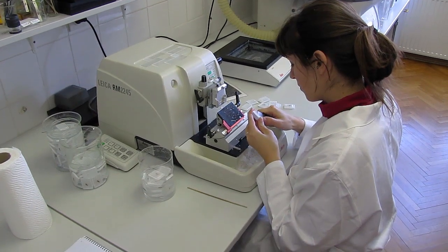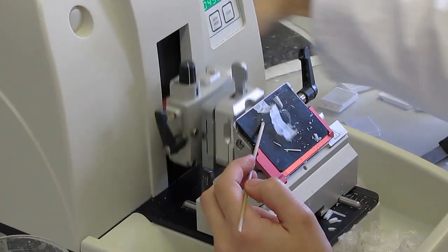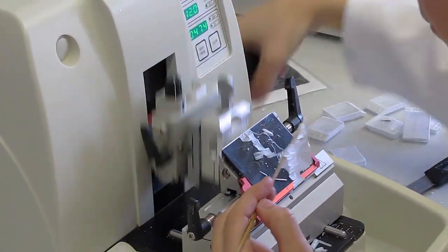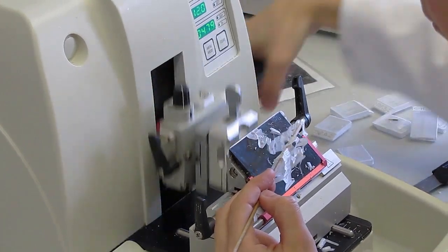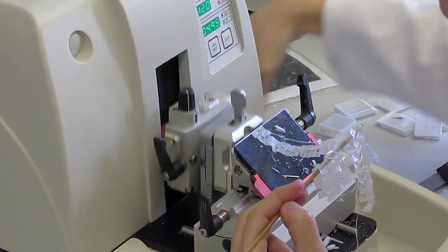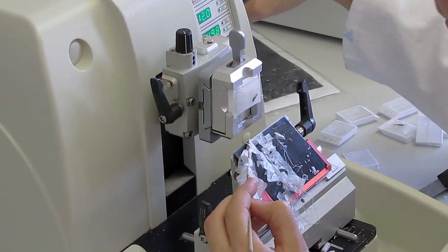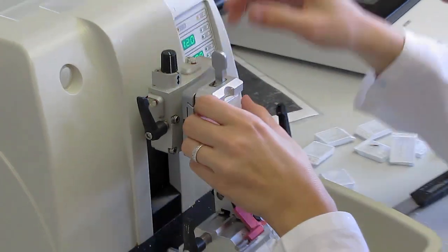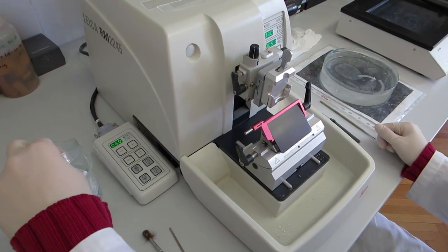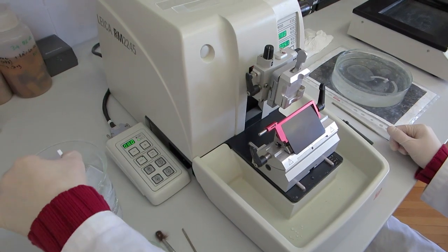Before sectioning, the paraffin blocks should be trimmed. This removes excess paraffin and levels the surface. Still, the cut sections are not yet suitable for further processing. The trimmed blocks should be placed into cold water for at least 2 hours or overnight to soften the woody tissue.